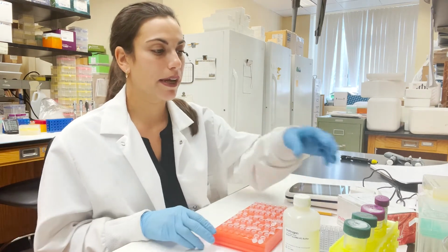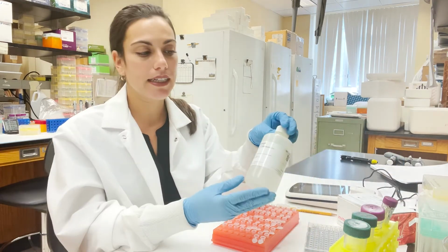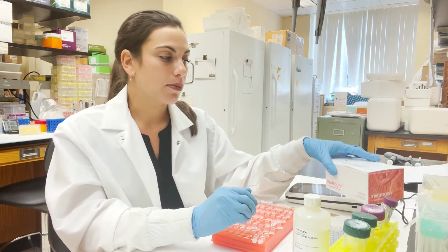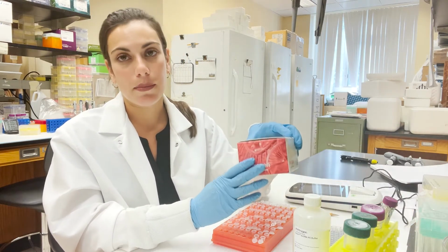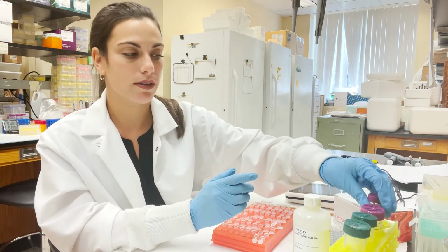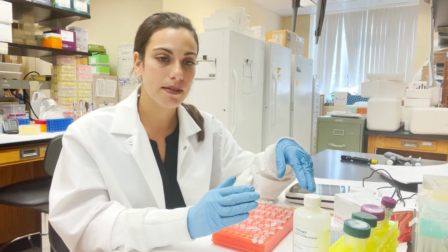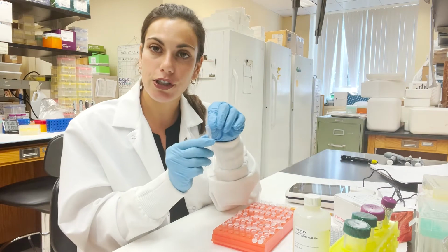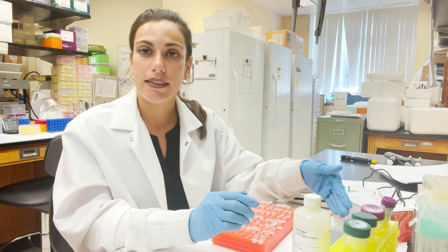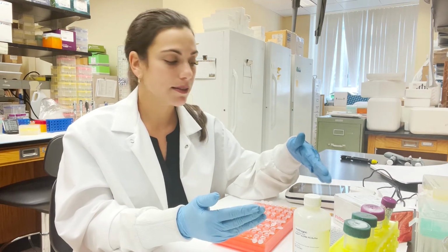What we'll do is we'll make a working stock solution where we have a ratio of 199 microliters of buffer to 1 microliter of double-stranded DNA reagent. And I'm leaving this in the box until we use it because it is light sensitive. That's also why this is tin foiled. We mix that up and we pipette 196 microliters into every one of these little Qubit tubes. We then add 4 microliters of our DNA into each of these tubes. We let it incubate for 2 minutes.